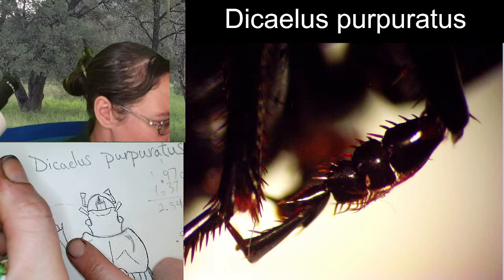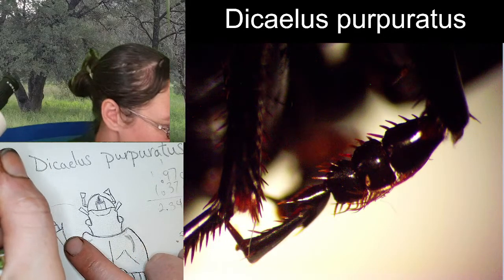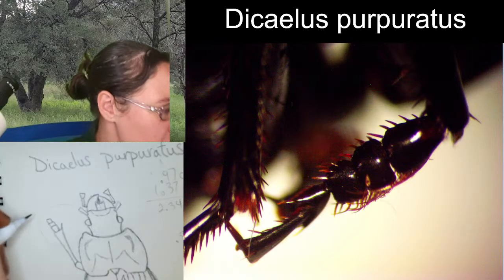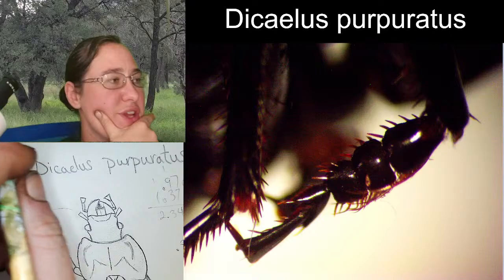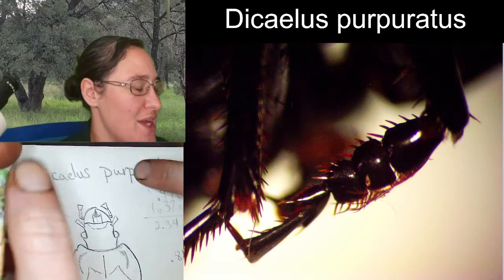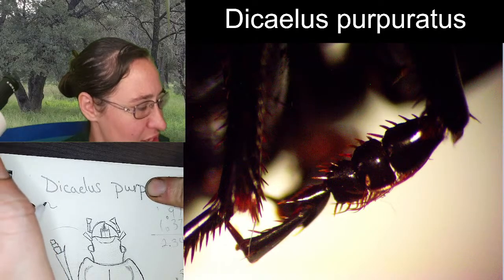The second one's a little bit flatter. Two. The third one, fairly round. Three. Alright, the fourth segment here is an interesting one, because when you view it from the side, it's going to have this notch.